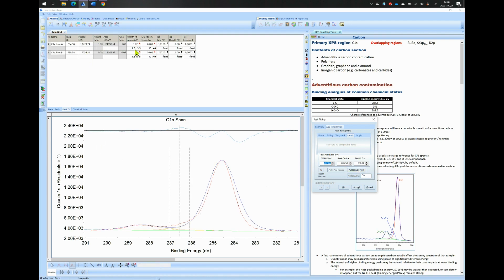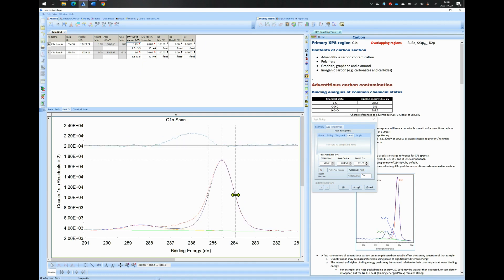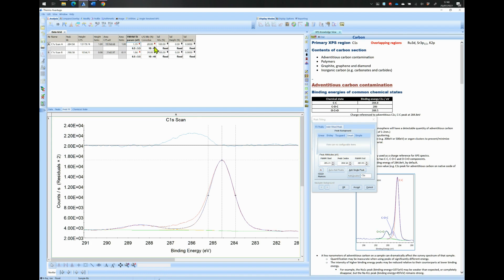The width for a standard Carbon 1s peak is around 1.1 to 1.4 eV on this instrument. The Lorentzian to Gaussian ratio or LG ratio is expected to be 20% for that kind of width. For a width below 1 eV this LG ratio can increase to a value between 30% and 60%. The narrower the peaks, the higher is the LG ratio.